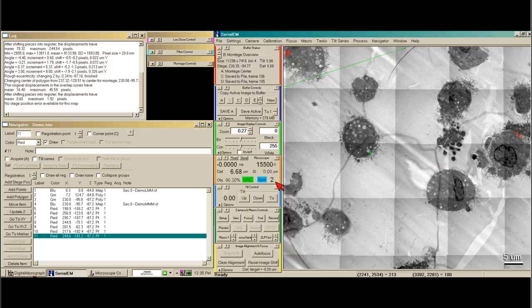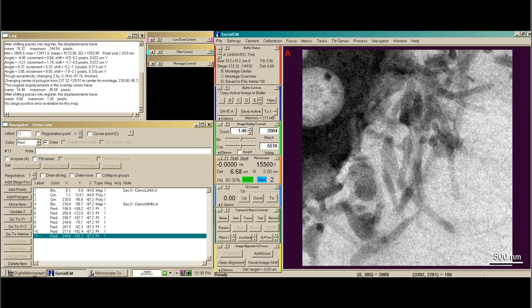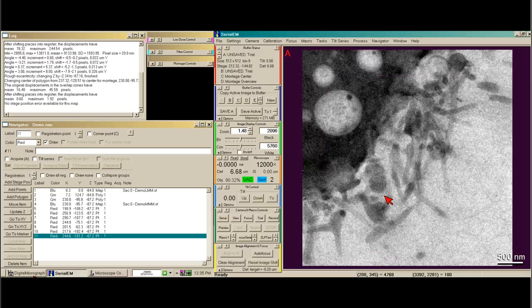Let's see what 15,000 looks like. I'm going to take a trial image because it's a fast picture — and that's the kind of image I would see. I think that's a little too high mag, so I'm just going to click down one more. This looks pretty good.